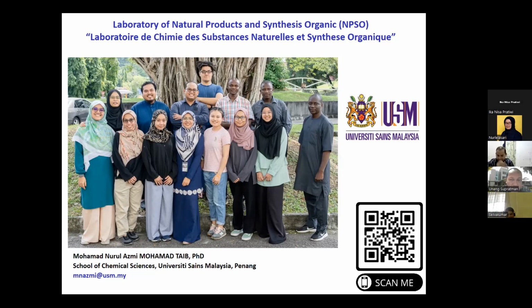Intan will maybe study in your lab next month. Okay, where is Intan? Yes, hello, Dr. Azmi. My name is Intan Hawina. I want to ask one question. Is it possible in proton NMR that a peak is not perfectly split? If possible, what causes that? Thank you.